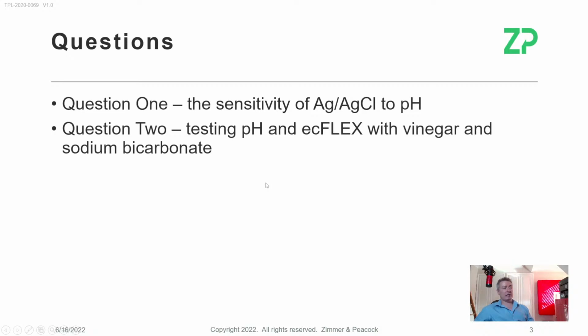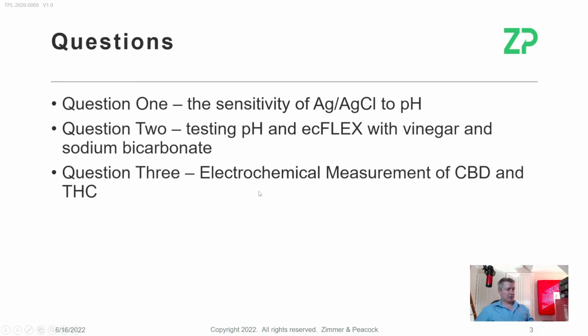Nice to see you this morning, Aftab. The second question is that a particular collaborator is having a problem with measuring vinegar and sodium bicarbonate on the ecFLEX. This is something that we've actually done ourselves. When the person was struggling, we did have a go ourselves, and it was successful. So I'll report on that.